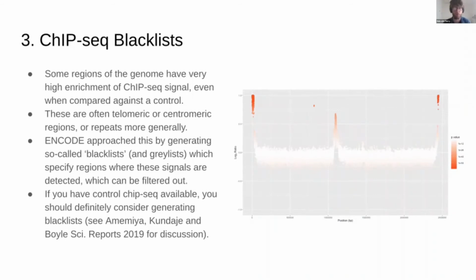I haven't done that for this tutorial because I didn't find one in time, but it's probably out there. And if you don't have a control, to be honest, a lot of these things will just mess up your analysis. You'd find peaks in strange places that look odd. I think it wouldn't completely undermine what you're doing. It just would create a bit of extra noise. Does that answer your question?